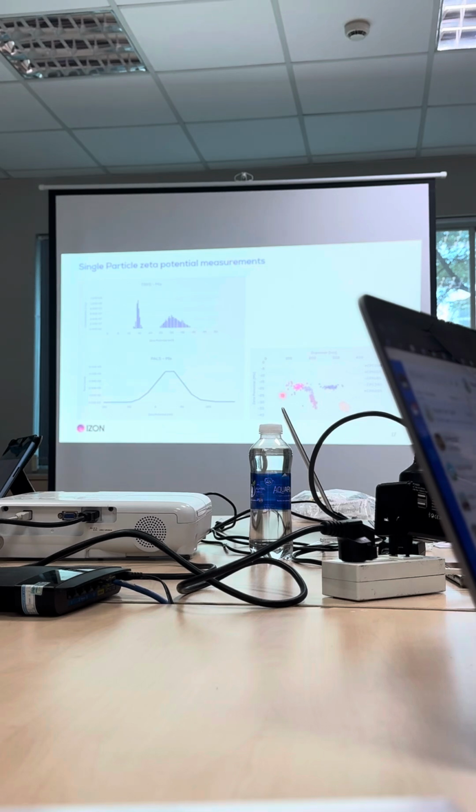So the TRPS, you see, reports each particle's size and zeta potential. By this, you can investigate your samples in detail, whether they will aggregate or not. Some people use it for long-term studies, for 3 months, 6 months, to check the zeta potential of particles. And here is an actual example of the calibration particles, neutral and slightly negative particles. You can see it can distinguish them.